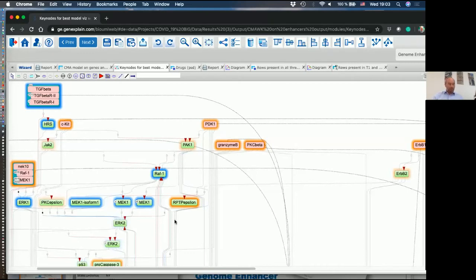Even for the same person, if you take a second sample, there will be a certain variability of expression due to technical noise, a kind of noise in the system, because different cell types are expressing in different ways at different time points. So you will never find exactly the same profile. But when two profiles are quite similar to each other, then the tool will predict similar drugs. So it's kind of deterministic in a sense, right?